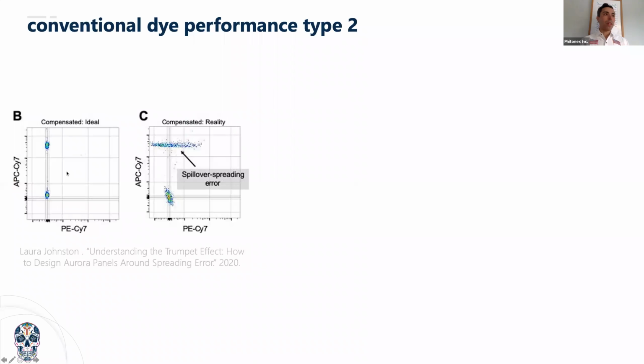One of the things we've always looked at subjectively, and will also look at objectively, is the way we've been thinking about all of our panel design efforts in leveraging more fluorophores: what do traditional dyes do, what could you leverage with a NovaFluor, and what could be possible in leveraging all the detectors on an instrument. In an ideal world, by definition, the compensated data would have the medians lined up, but in addition the standard deviation would also be equivalent. This would enable us to do much more automated analysis and make biological interpretation of the data much easier. That's the thing I still get excited about, because if you have clean fluorescence infrastructure, you can enable a lot on the analysis side.